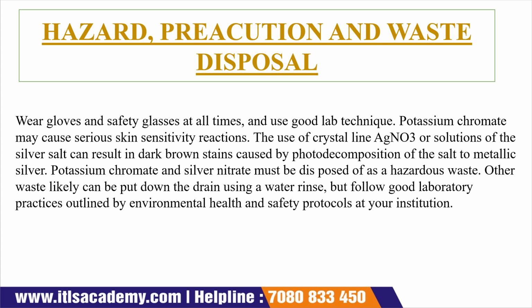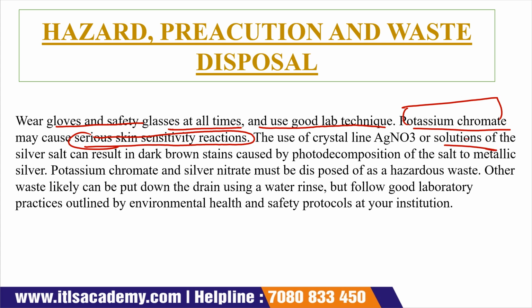Now see what is written on the slide. Wear gloves and safety glasses at all times and use good laboratory technique. Potassium chromate may cause a serious skin sensitization reaction. Silver nitrate or a solution of silver salt can also result in a dark brown stain, which is caused by photodecomposition of the salt to metallic silver.